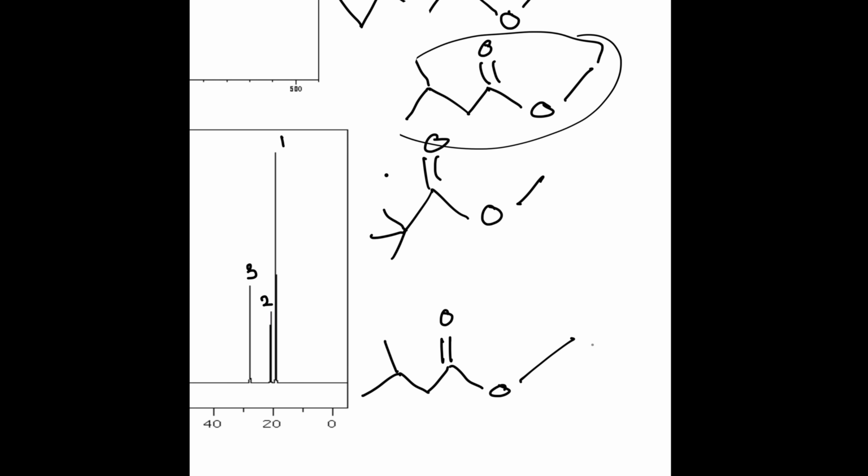So again, that is our predicted structure. I'm going to go ahead and label these. So these are all the carbons. These are the unique carbons that we have. And this first peak we have represented here is going to be represented by these 2 carbons that we have labeled here on the structure.